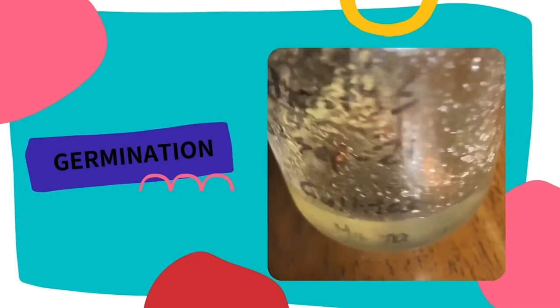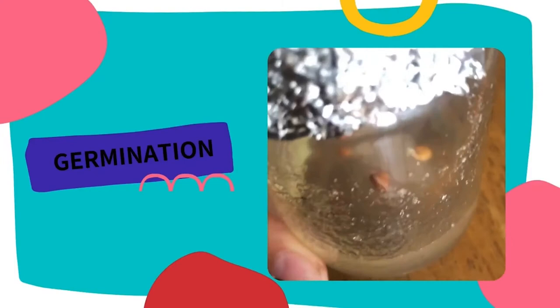The germination of the lentils took 2 days. In additional notes, this medium does not have hormones because those are not required for the germination process.